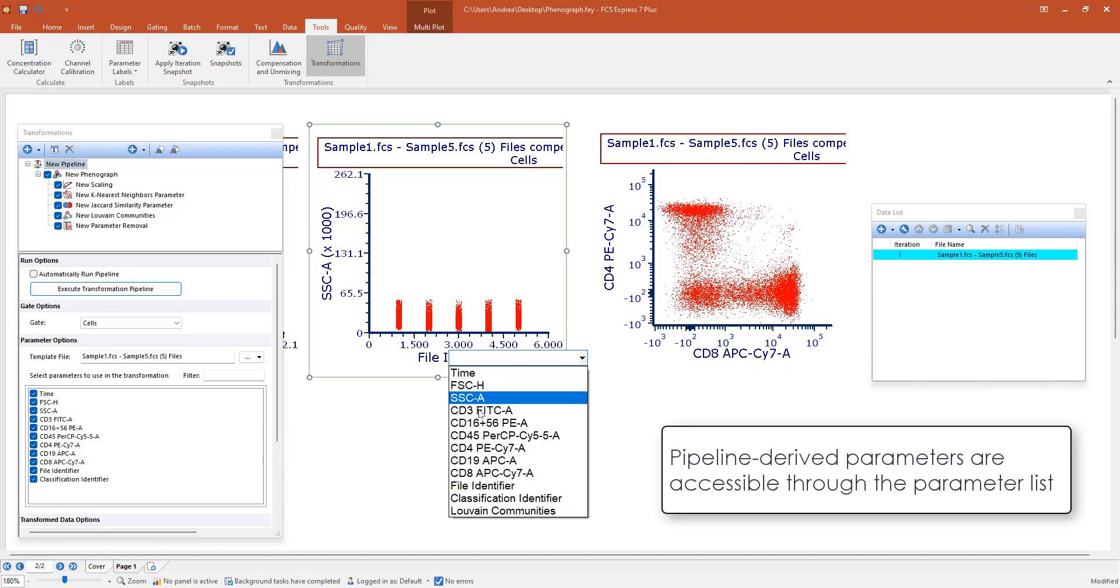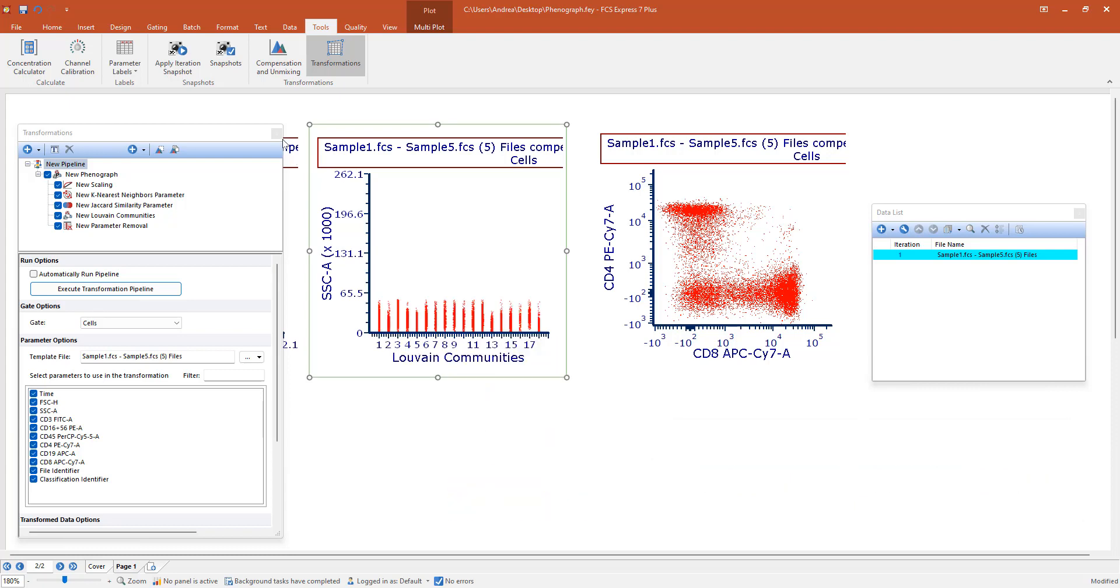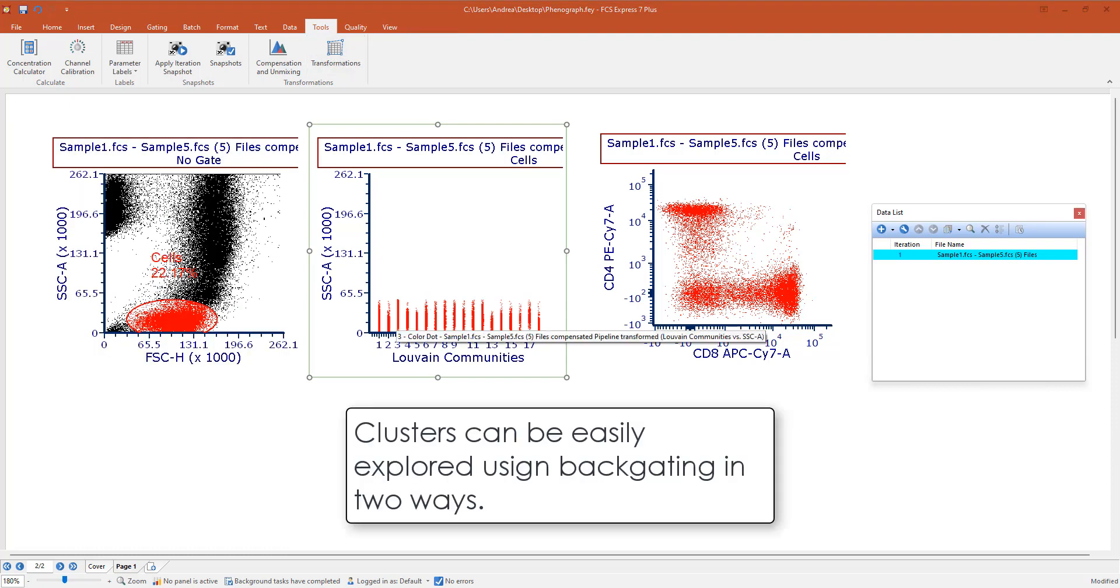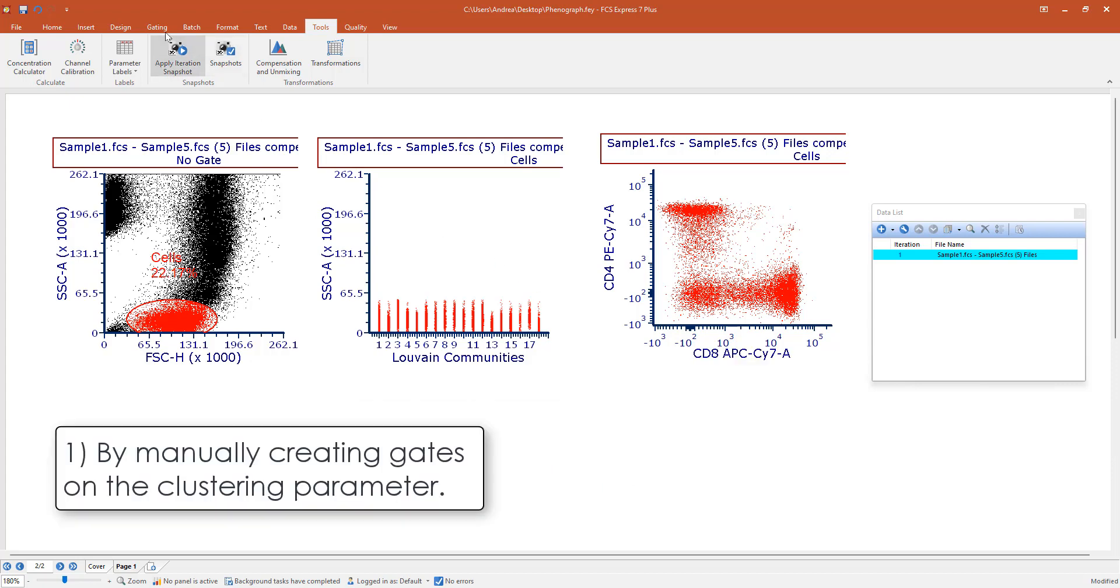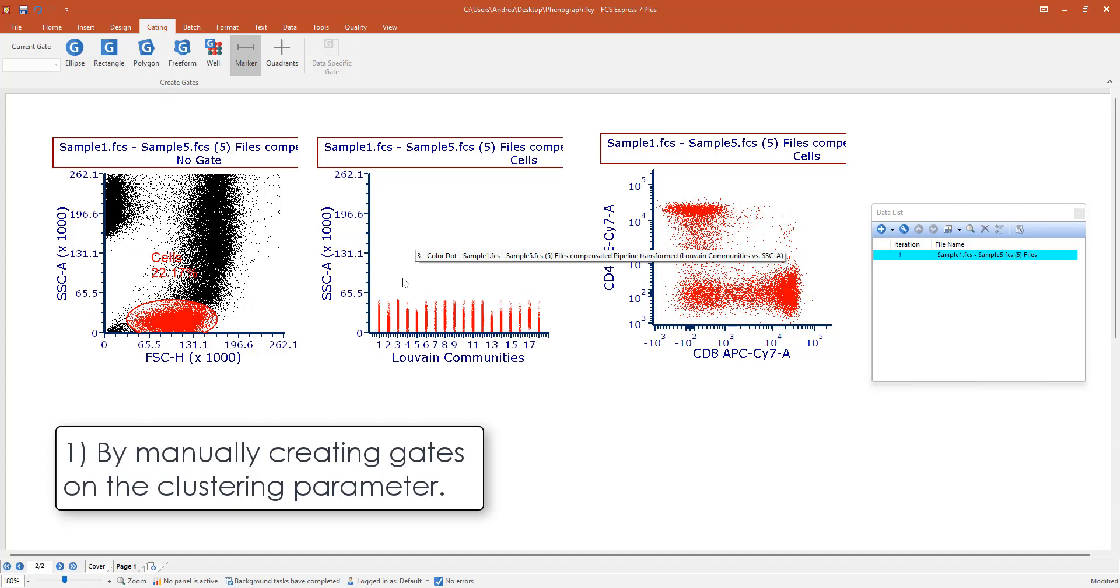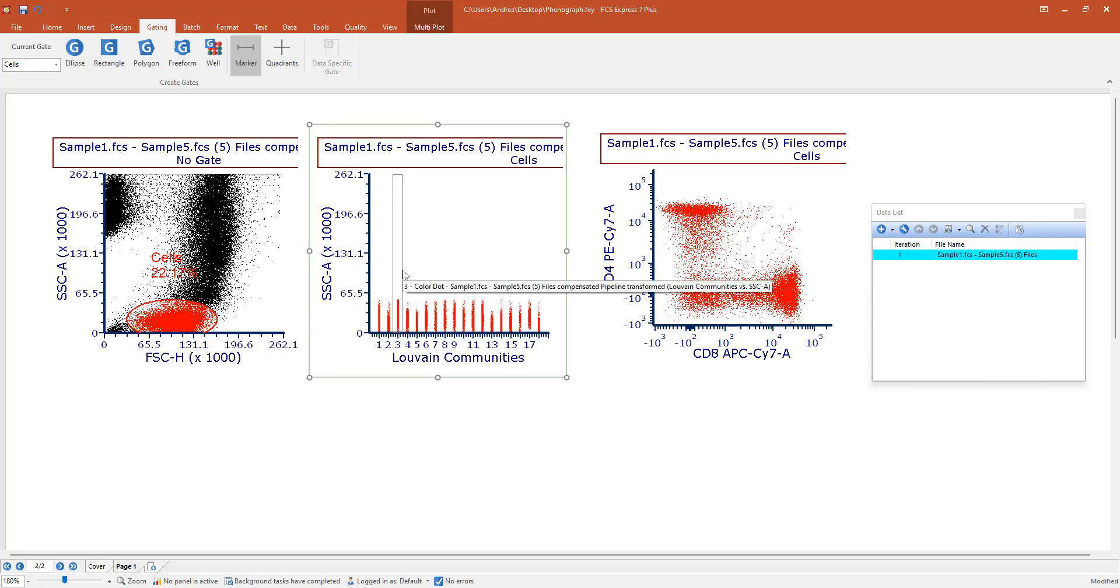Here you can immediately see that you have the results of the Phenograph calculation, the Louvain communities. There are a bunch of ways in which you can explore these clusters. You see here we have many of them. One way is by creating a gate. I usually create a one dimension gate, we call it marker on 2D plots on these Louvain community parameters. And then you can do backgating on every other colored plot.